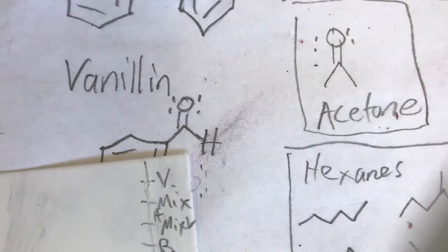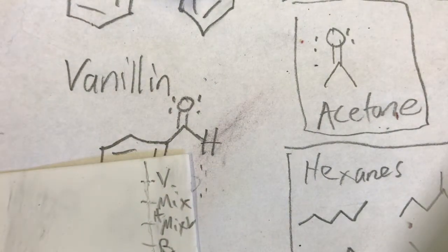Okay, now next up is the mix. I didn't even have to make a mix of benzophenone and vanillin, but I'll use it since I made it. So for the mix, I could have just spotted the benzophenone and the vanillin from their vials separately onto the same spot to make a mix, but I have the mix, so I'll use it. Okay, so here we go.